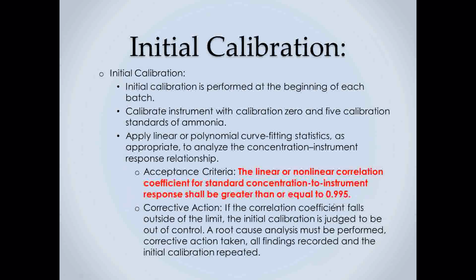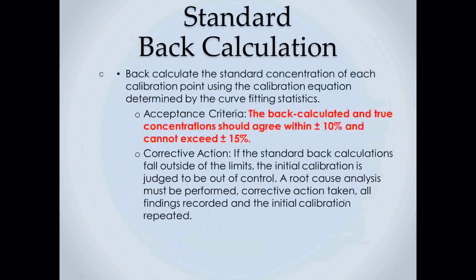We also have standard back calculations. In that, we say you back calculate your standard concentrations from the calibration equation. And the concentrations that you come up with should agree within plus or minus 10% and cannot exceed plus or minus 15% of what you calibrated to.